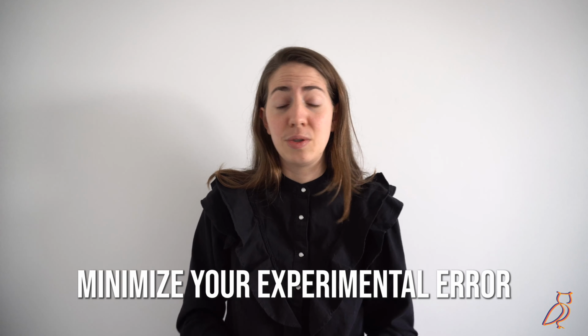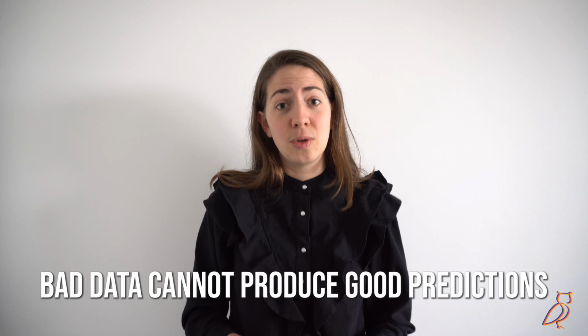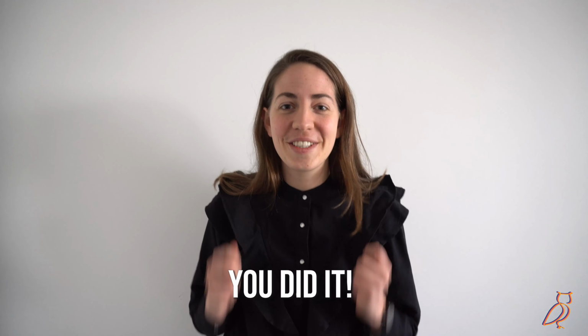Oh yeah, and make sure to minimize your experimental error due to buffers or other factors, because bad data can never produce good predictions. So you did it! You did your first scanning experiments. Are you ready to perform any of the approaches we discussed in our review?